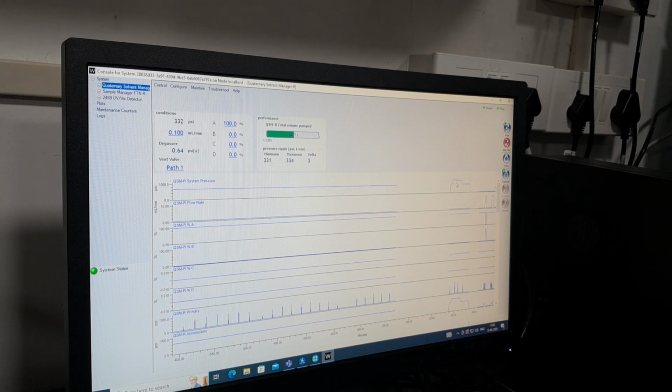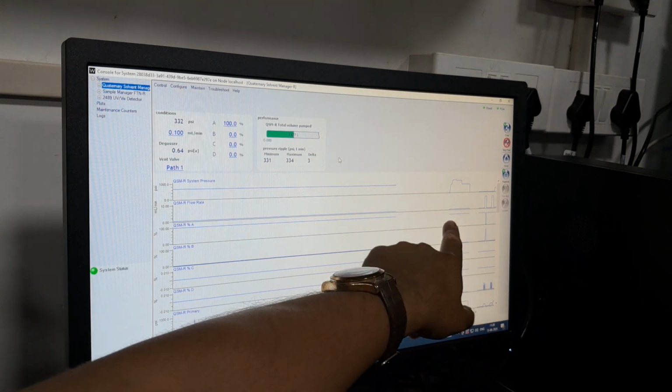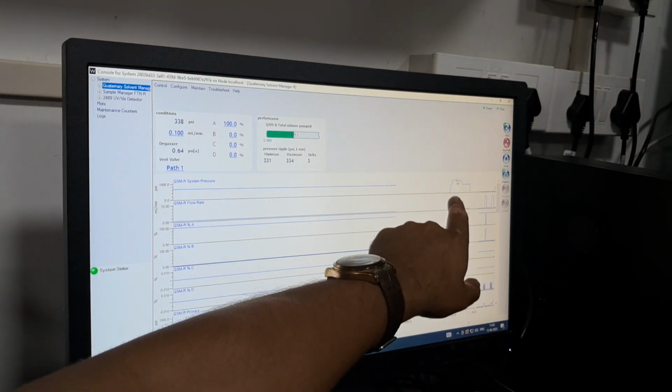Just arbitrary values? Some random values? No, it won't show the value actually. It won't give the flow. Once power shuts down, the instrument goes to off mode. Now my question is, what is this one?